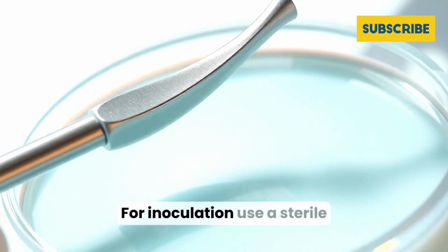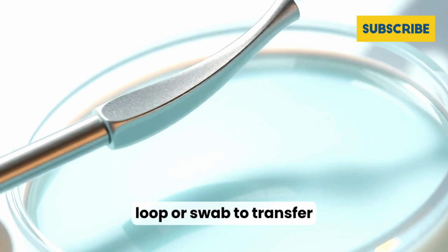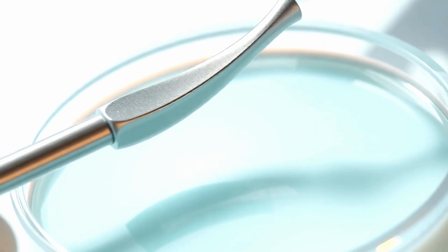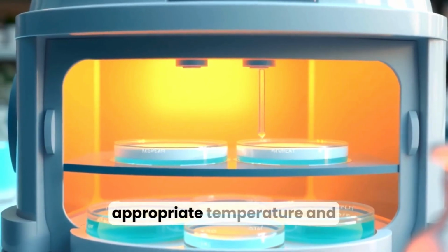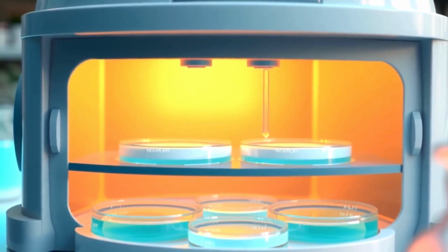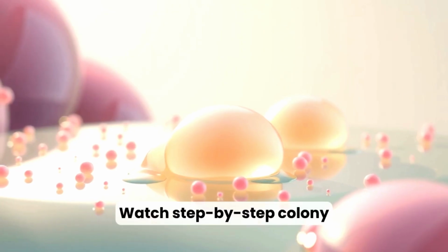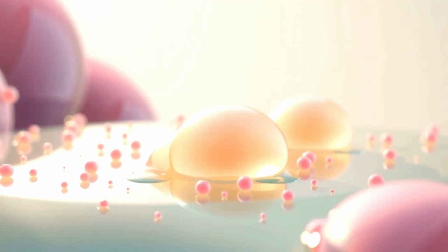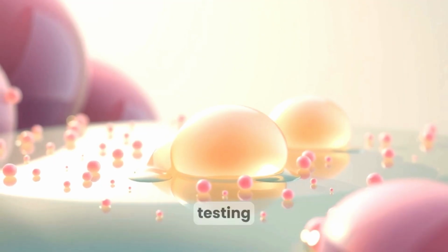For inoculation, use a sterile loop or swab to transfer specimen onto the plate using streaking techniques for isolation. Incubate plates at the appropriate temperature and atmosphere, then monitor for colony appearance over time. Watch step-by-step colony growth. Small microcolonies become distinct visible colonies suitable for further testing.